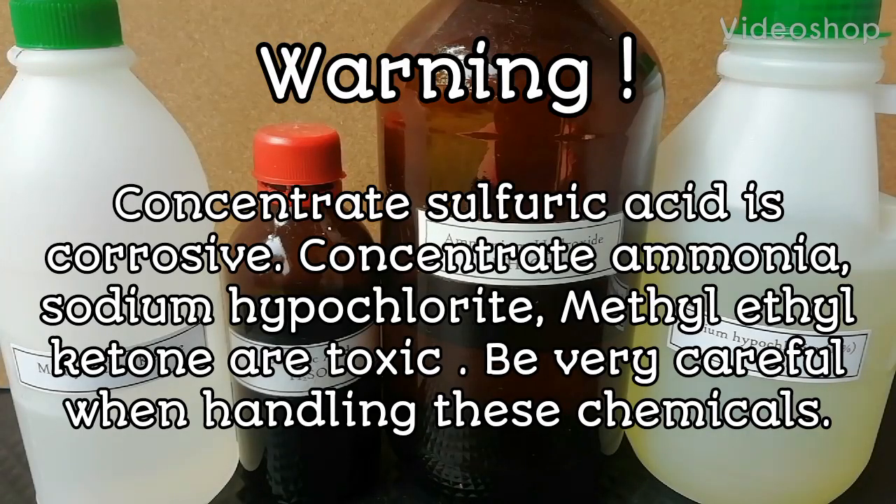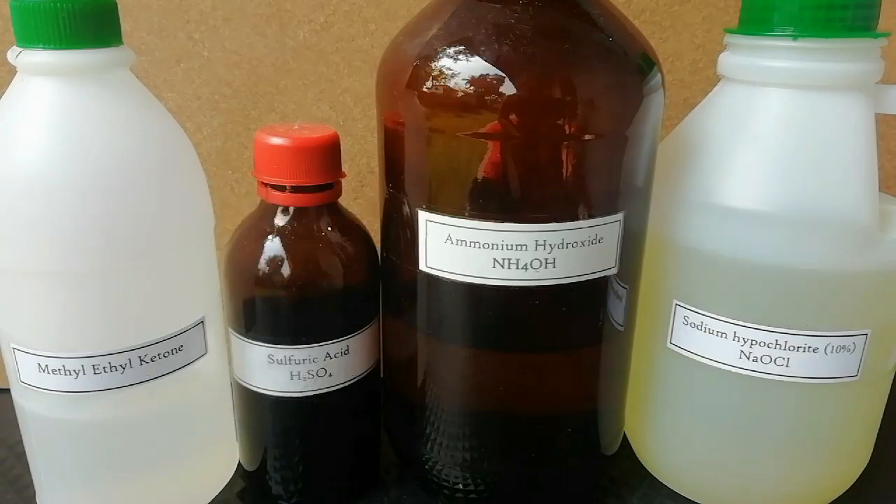Warning. Concentrated sulfuric acid is corrosive. Concentrated ammonia, sodium hypochlorite, and methyl ethyl ketone are toxic. Be very careful when handling these chemicals.